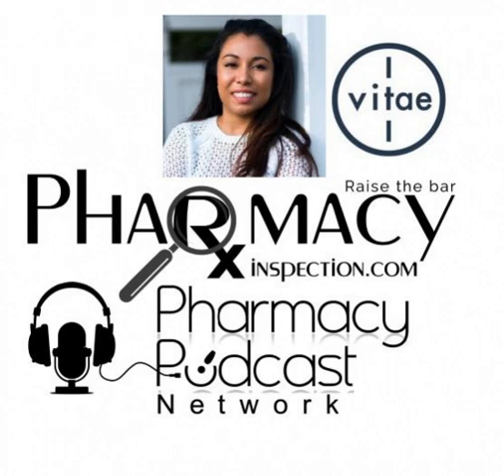Another option, of course, that's more of a hardware feature that we are also looking at implementing and testing in the pilot, to see which one's more robust and more usable in this context, is by simply measuring and having another check on the amount of volume extruded. Because as we know, if the concentration goes incorrectly, we can figure out the exact volume that should be going out the other end, and we can measure that with another means of hardware.